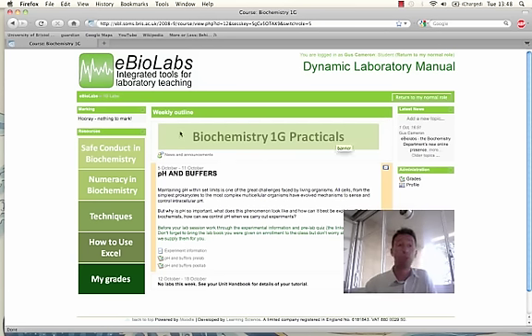So when the student logs on, they have resources here such as safe conduct and biochemistry labs, some resources for helping them with their numeracy, a techniques manual, how to use Excel, and a gradebook, a customized gradebook that I'll talk more about later. But in advance of the practical, the student has to log on to eBiolabs and access the information about the experiment they're going to be performing later that week.